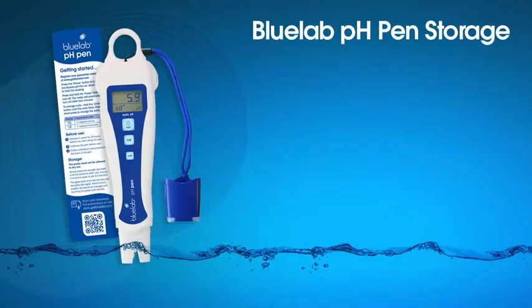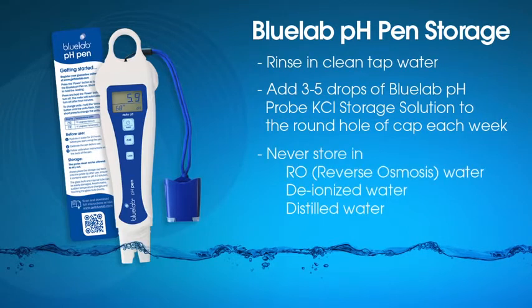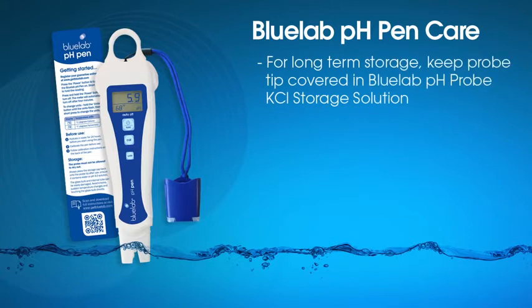Storage of your Bluelab pH pen is simple. Before storing your pen, give it a quick rinse in clean tap water. The cap should have a small sponge in it already. Add 3 to 5 drops of Bluelab pH Probe KCL storage solution to the round hole of the storage cap. Never use or store a pH probe in RO water, deionized, or distilled water. To maximize the performance and life of your pH pen, Bluelab recommends keeping it upright in a plastic container with Bluelab pH Probe KCL storage solution covering the probe tip.